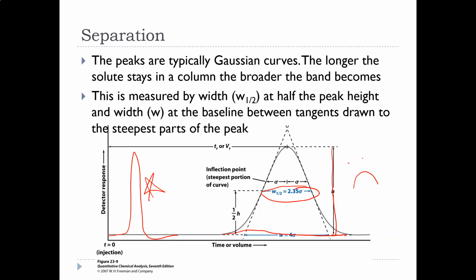Because the x-axis is time. So the retention time, we're going to go with the top part of the peak. So let's say that was 13 seconds. Well, maybe this was 9 seconds and this was 17 seconds. So that's not a good result if there was this 6-second range where the sample was coming out. We don't know, was there a second chemical that came out at the same time? So what we want is really narrow, and we're going to come back to that. But we'll be seeing the symbols W1/2 later. So that's just where that comes from. It's the width of the peak halfway from the bottom to the top.